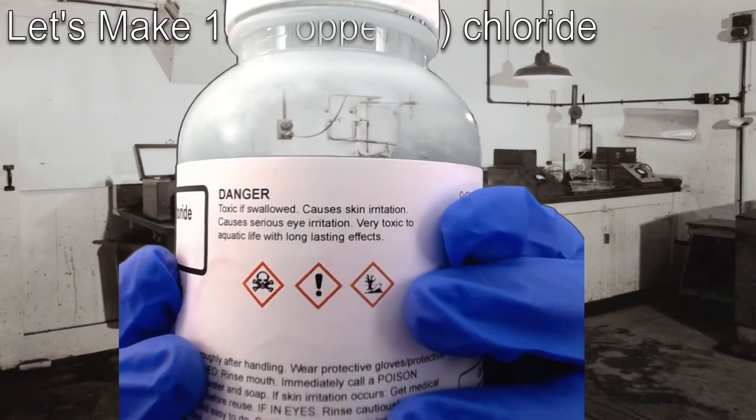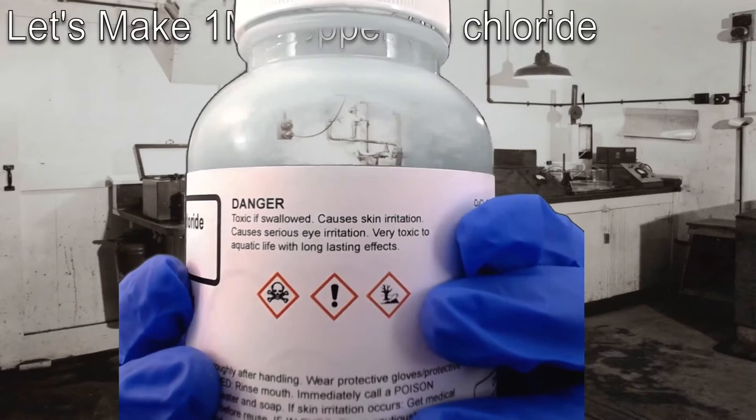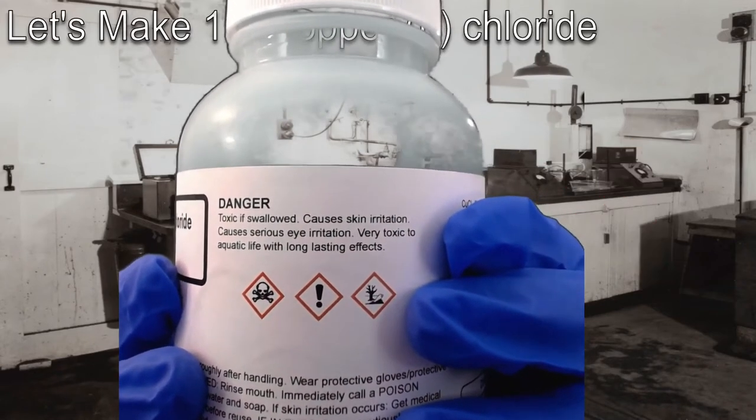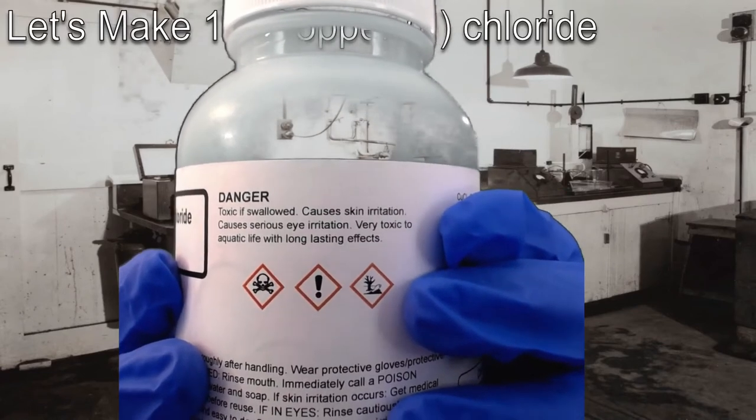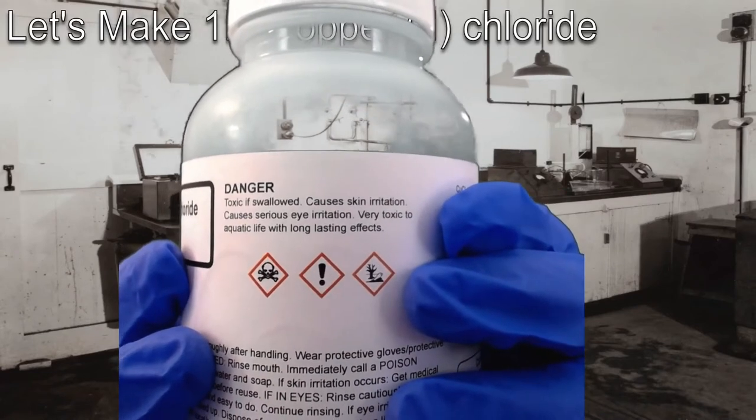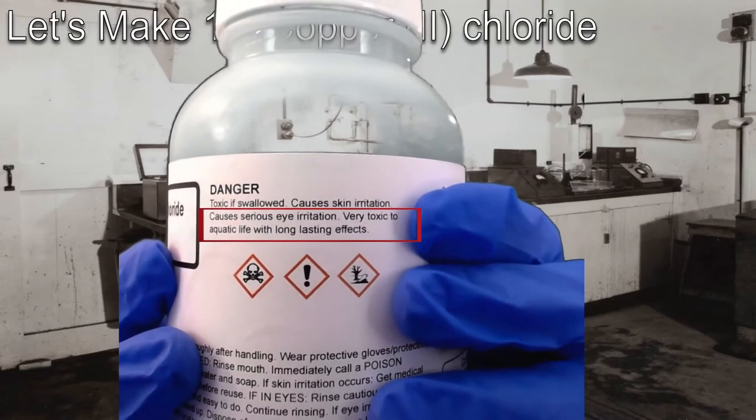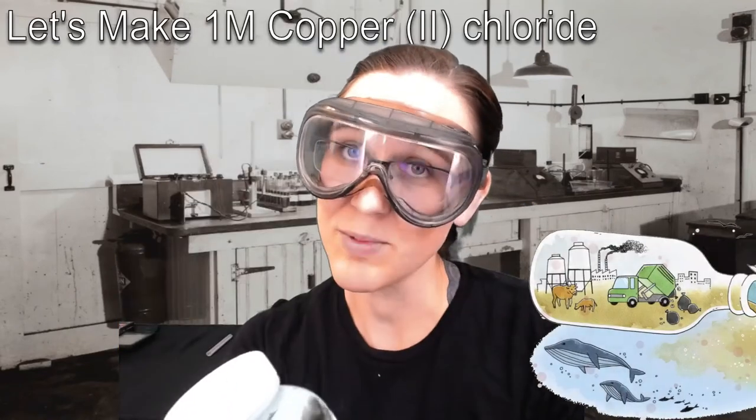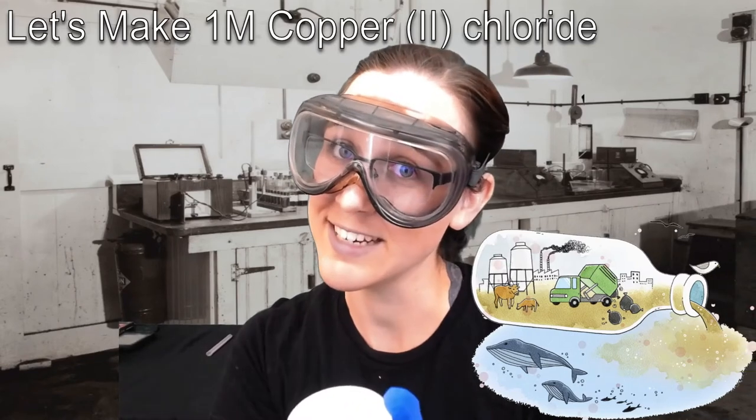Check out these OSHA safety labels. We've got toxic skull and crossbones, an exclamation point warning, dangerous, and the dead fish in the tree. That's clearly stating that it is toxic to the environment. Very toxic to aquatic life with long lasting effects. So obviously, we don't want to be dumping CuCl2 down the drain.